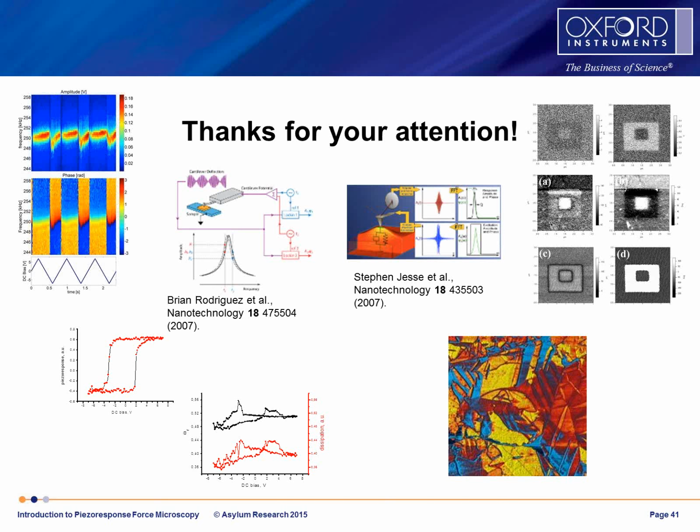This is Roger. I'm going to stick one other comment in there, Sergey, and that is that in your microscope there is a chance for electrical crosstalk. So as you're driving, say, your tip at a high voltage, that can result in currents that can excite resonance in other mechanical parts of the microscope. For example, if you have a shake piezo for doing tapping mode or something else like that, you can actually shake that piezo that has nothing to do with your sample, but that can lead to a signal that can appear as a background, which can cause confusion on imaging sometimes.